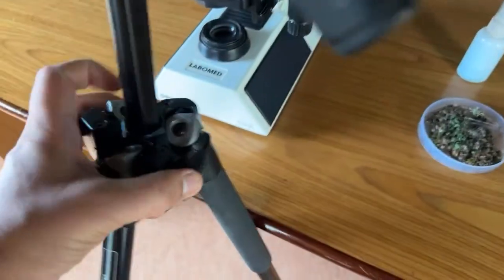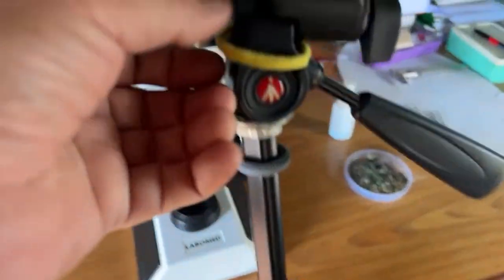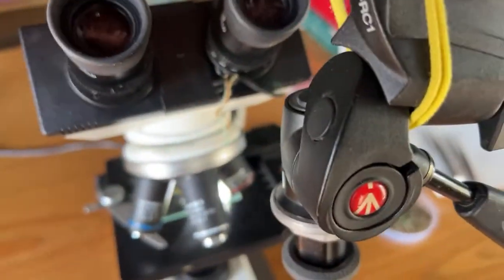Well, obviously we have microscopes these days which have a better lighting system, and they also provide us with this see-through and this reflective light arrangement. But then, you see, I realize the fun in doing things my own way. So this gives me a better sense of involvement in this whole process.